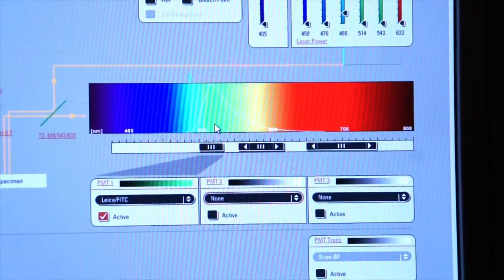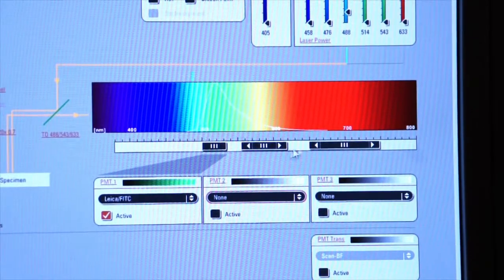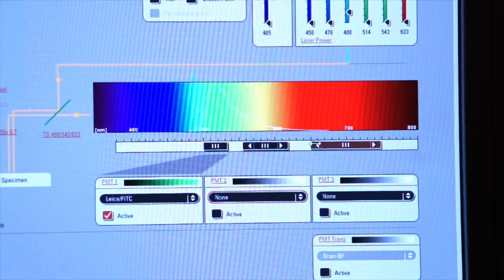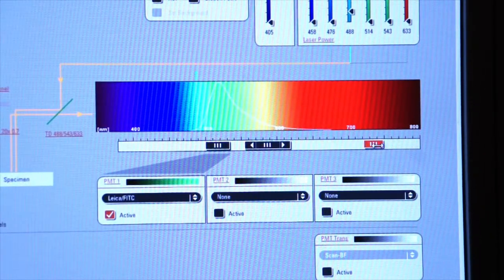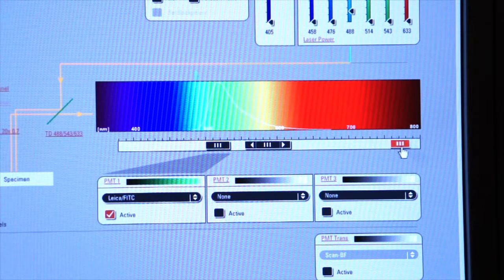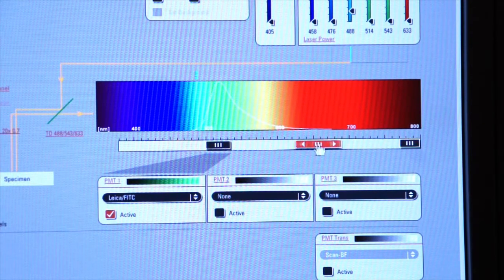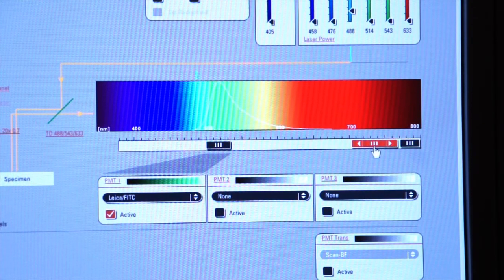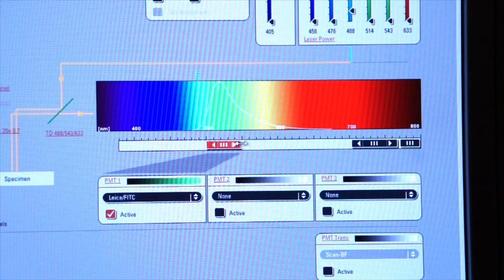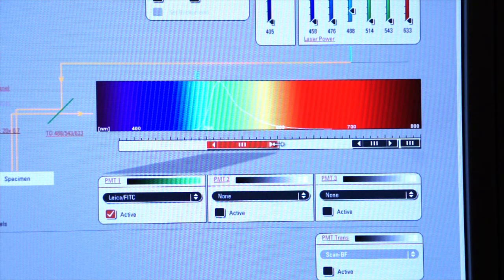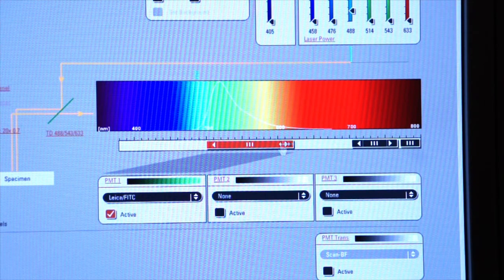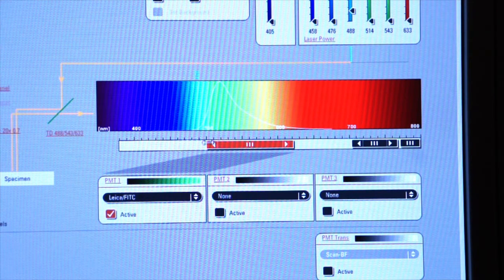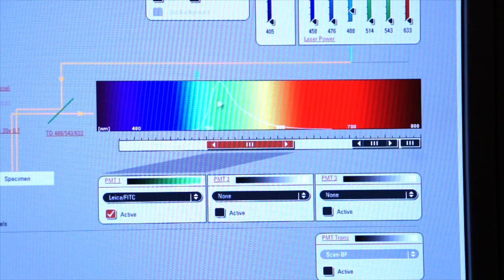And let's do one other thing. Let's close down our other slider bars and move them to the right. So we'll move these down out of the way. And let's extend the length of this PMT. And so you can see that we're now going to be collecting photons from a larger area underneath this curve.